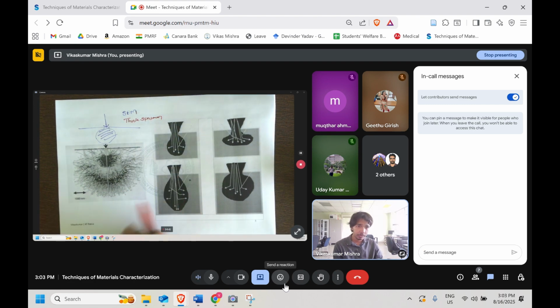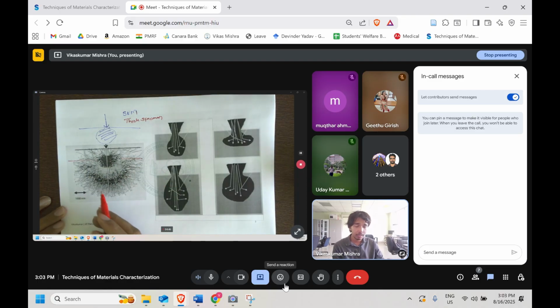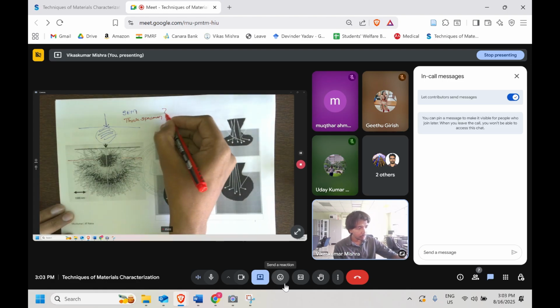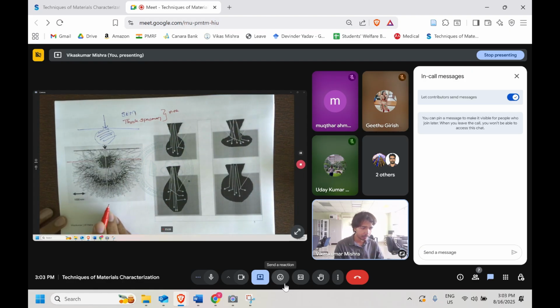For example, if you are using a thinner specimen, the interaction only happens up to a limit, so we cannot say what the volume of the interaction is. It will be restricted. While if you allow the entire beam to interact with the specimen, as in the SEM, that is where it happens. In the TEM, the beam passes directly through the specimen. So Monte Carlo simulation works very well for SEMs and thicker specimens.